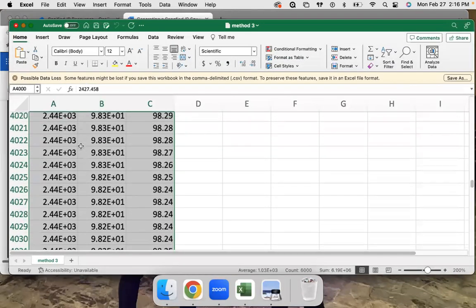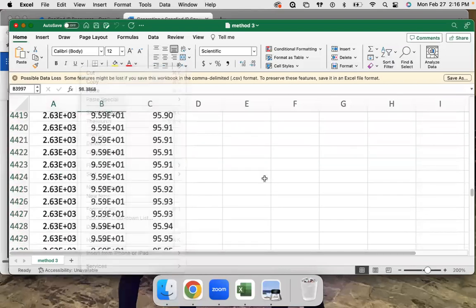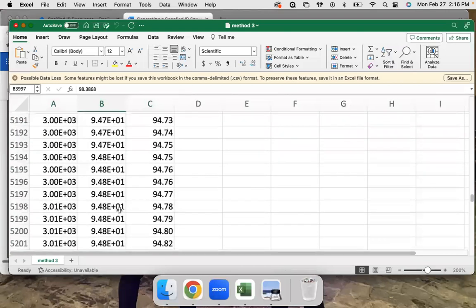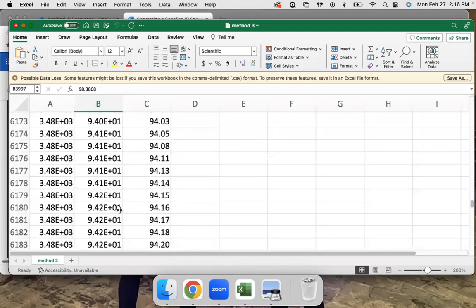And now we're going to do this one last time. From 6,000 to the end.